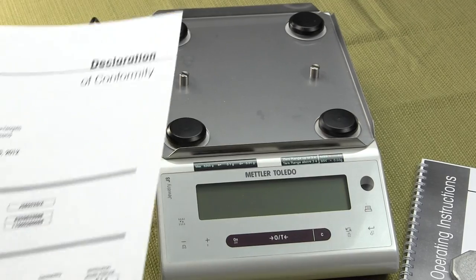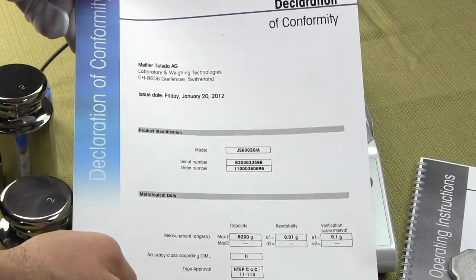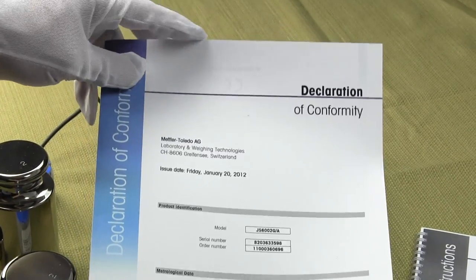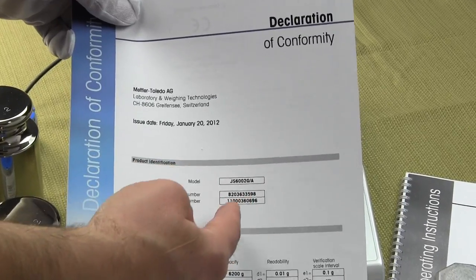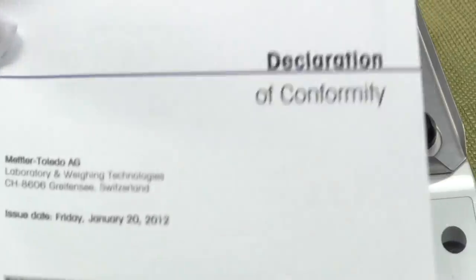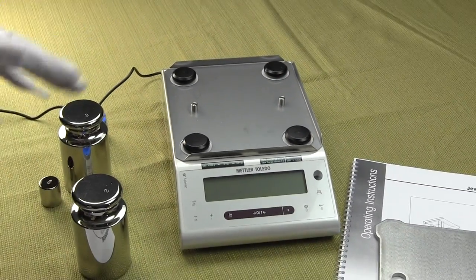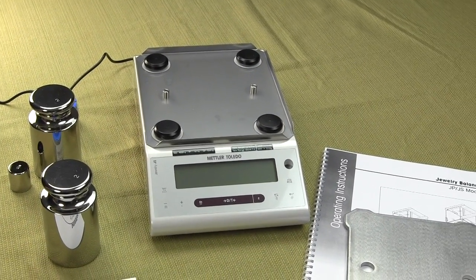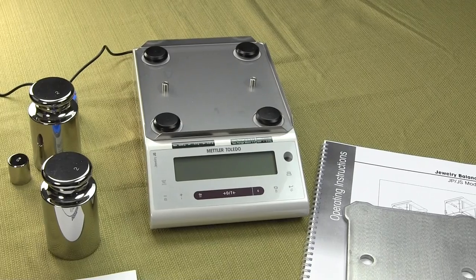A totally beautiful feature about the balance that I like is it is battery powered. And the balance comes, Mettler Toledo gives you a nice declaration of conformity, specifying the model, the serial number. So that's the Mettler Toledo. It comes with a one-year limited manufacturer's warranty.